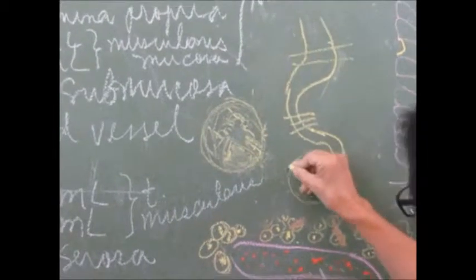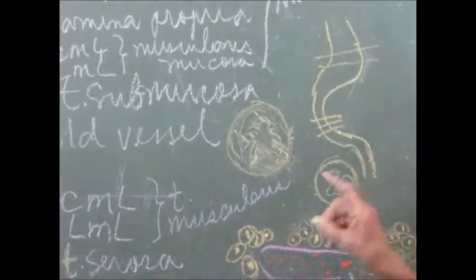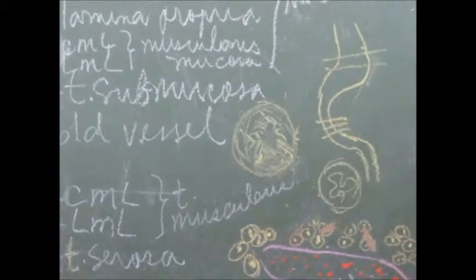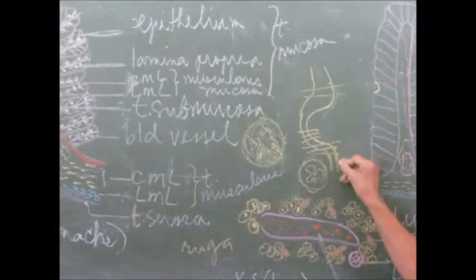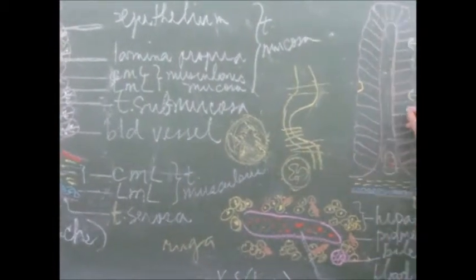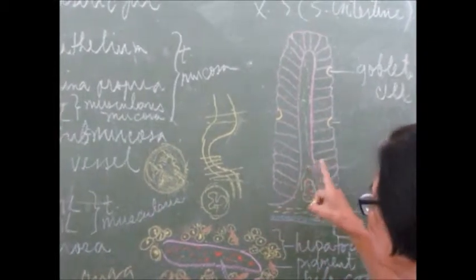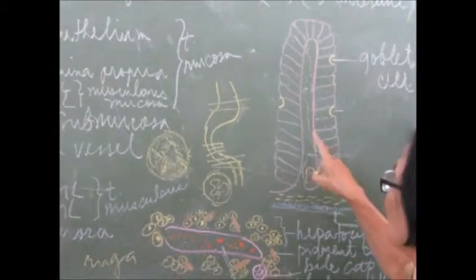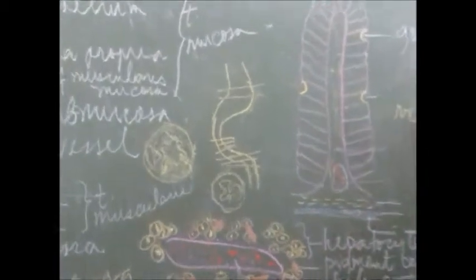And you have a smaller cross-section because the intestine has a narrow diameter. Okay. So you cut this again cross-sectionally. And you will find these finger-like elevations. Now, the finger-like elevations of the small intestine are known as the villi.